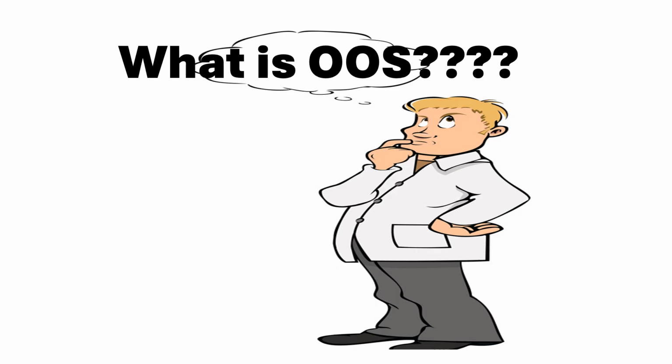Now, when the sample fails, you just can't report it and release the report, because you have to be confirmed that the sample has failed and the result that you have provided is correct.